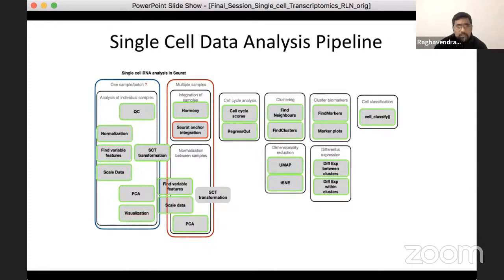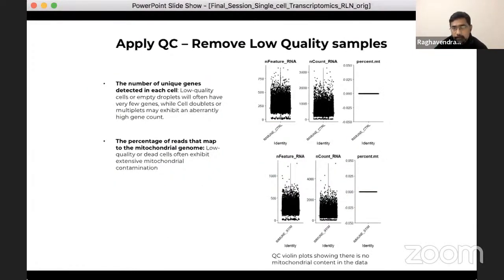And once these distinct clusters are identified from the UMAP and t-SNE and other clustering methods, then we can finally establish contrasts for which differentially expressed genes can be identified and quantified, and we can analyze and interpret those genes that are significantly upregulated or downregulated for different distinct cell types, and extrapolate that analysis to relevant biological interpretations.